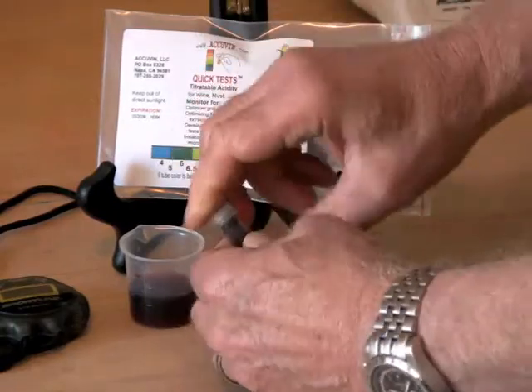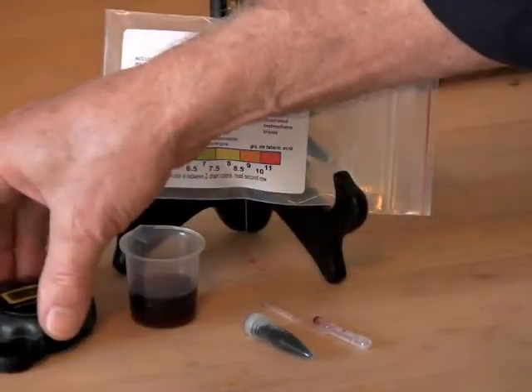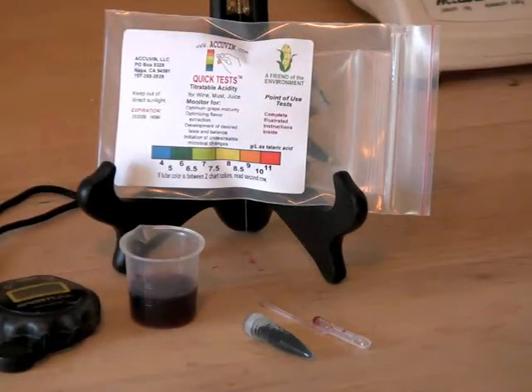Place the cap on the tube, shake, and wait 30 seconds. We'll start a timer.